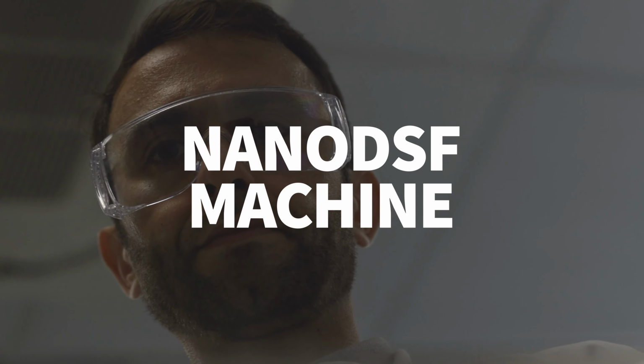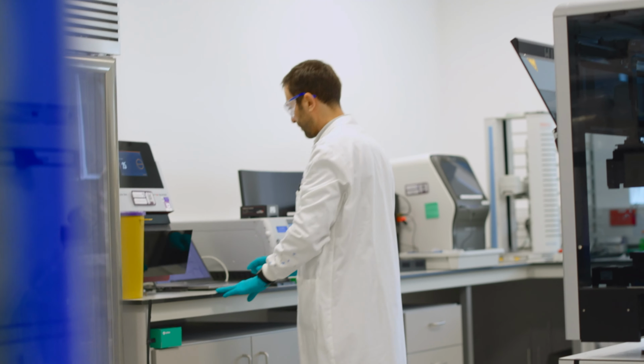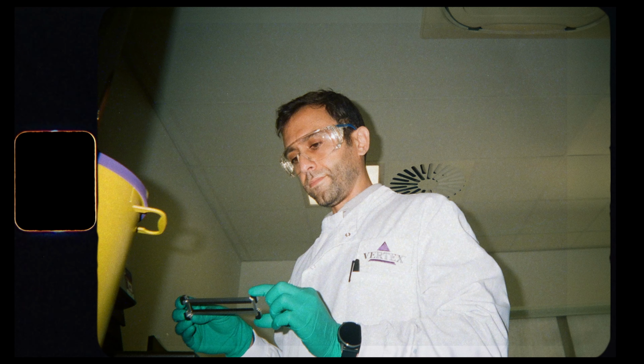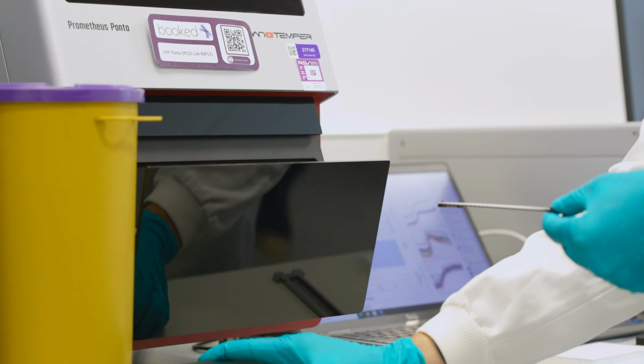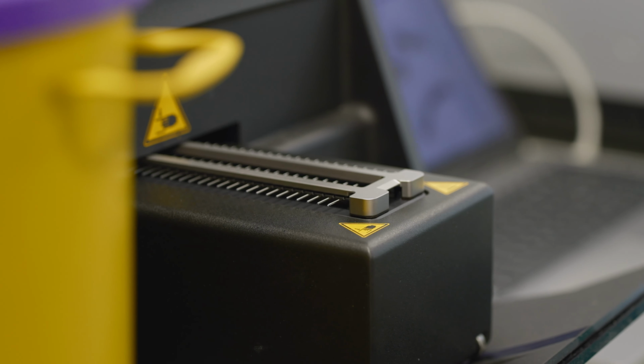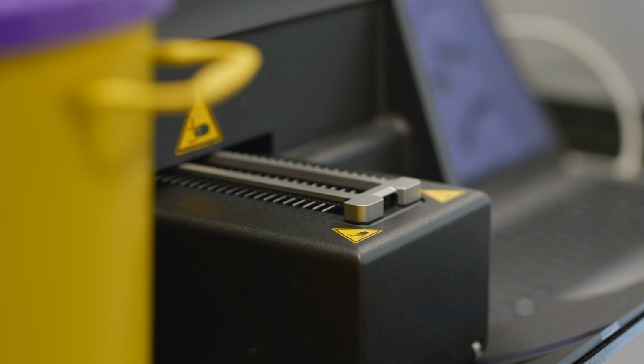So now we are next to the Nano DSF machine to measure stability. We will heat up the protein sample, and the protein sample at some stage is going to unfold and will give us a Tm value which reflects the stability of the protein. So if we find a condition where the protein stability is higher, this will be something that we will move ahead with and test in cryo-EM.